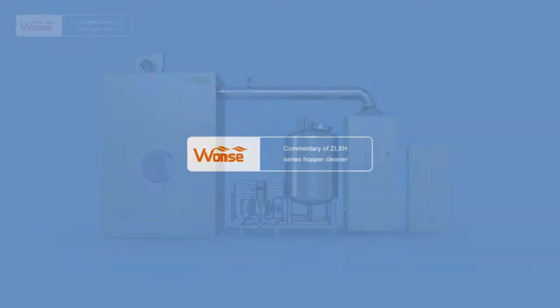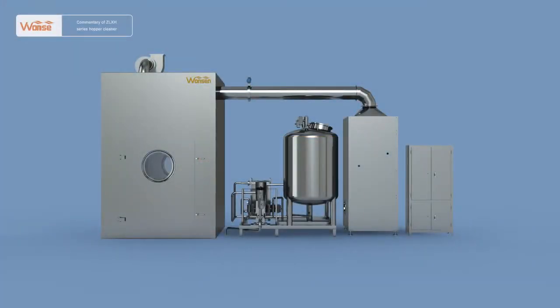Commentary of ZLXH-series Hopper Cleaner. With the widespread use of hopper mixers and hopper material-transforming equipment and the gradual expansion of production scale of pharmaceutical plants, the cleaning of two-sided devices such as hoppers becomes an important concern.